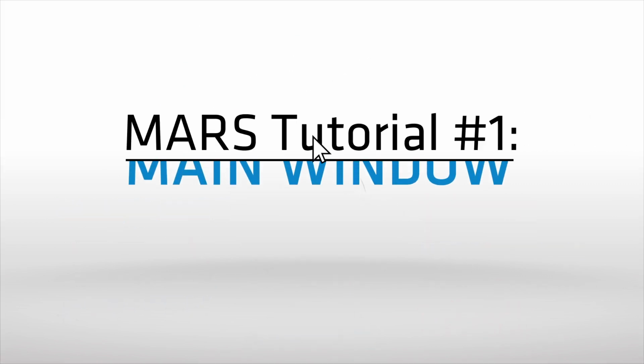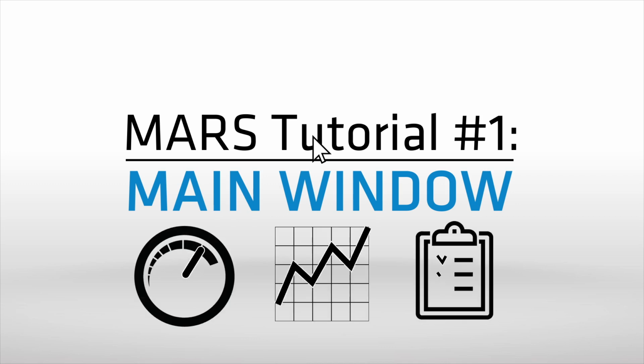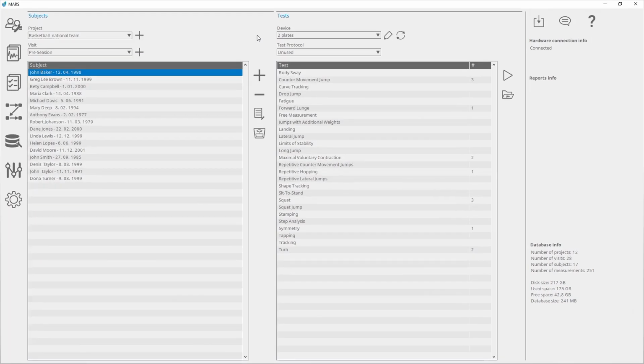The main window is the entry point for the measurement, analysis, and reporting software. From the main window, all other units are also accessible. After the start of the application, the main window is shown. It is divided into 3 panels.